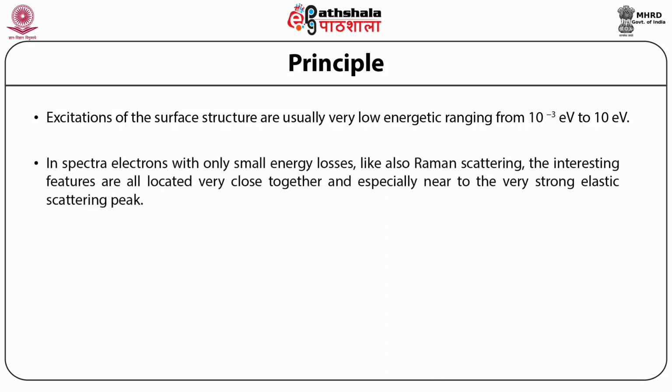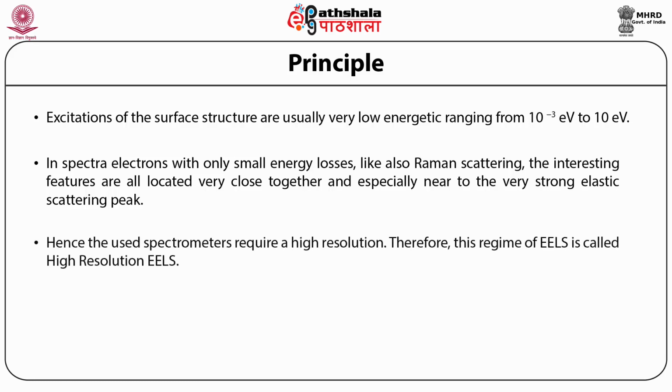In spectra, electrons with only energy losses, like also Raman scattering, the interesting features are all located very close together and especially near to the very strong elastic scattering peak. Hence, the used spectrometers require a high resolution for getting good quality results.